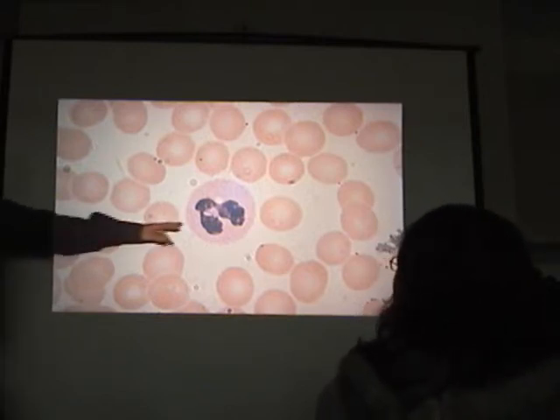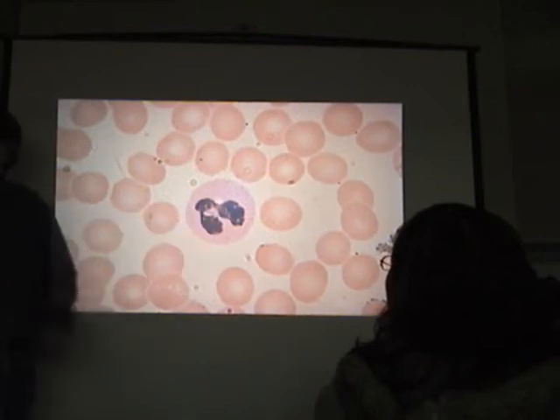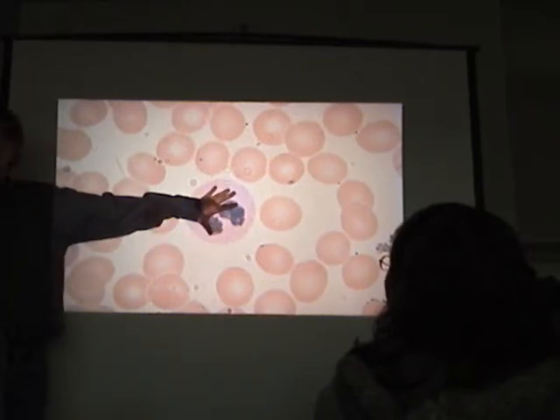If the nucleus is segmented, think of a string of sausages that are connected. You twist the casing. That's kind of what's happening in the nuclear material. If you see that, you have to start thinking, well, it's a granulocyte, but if it's segmented, it's got to be a neutrophil, all right? The second thing is you need to get this wired. There are granules in this pale staining cytoplasm, but they don't stain as intensely as eosinophils, which would be pink, or basophils, which would be purple, okay?